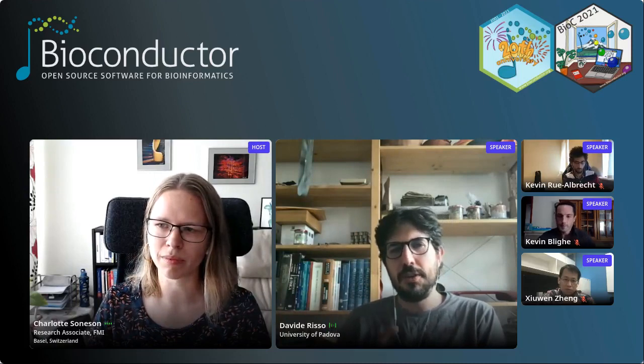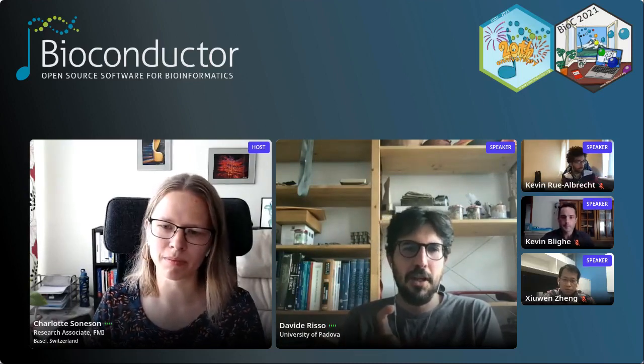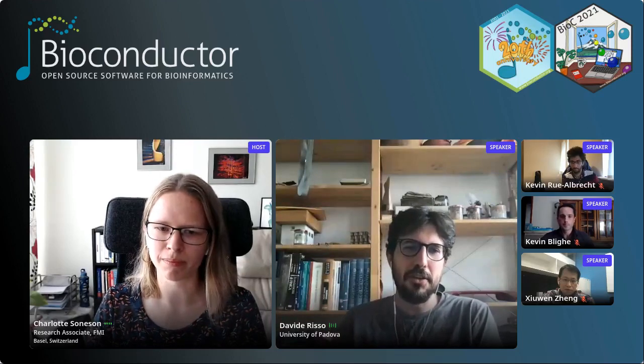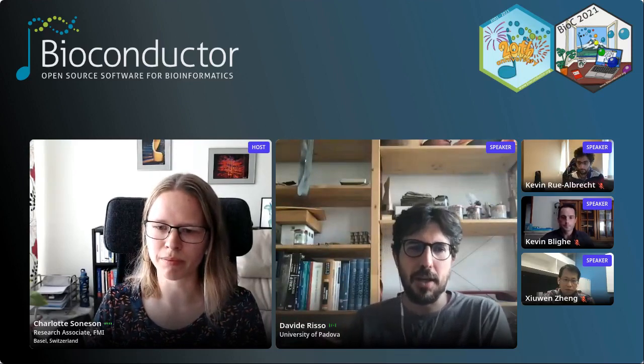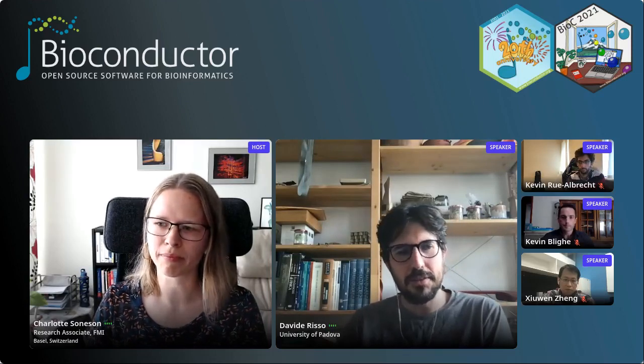Basically, we're doing something sort of the opposite of what people usually do. We're not rejecting the null hypothesis, but failing to reject it. So if you have low power, it won't work, right? So you kind of need a lot of cells, and that's why we waited to have 10x Genomics data with a lot of cells, because otherwise it's not.